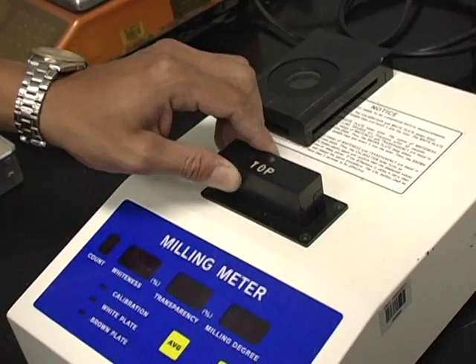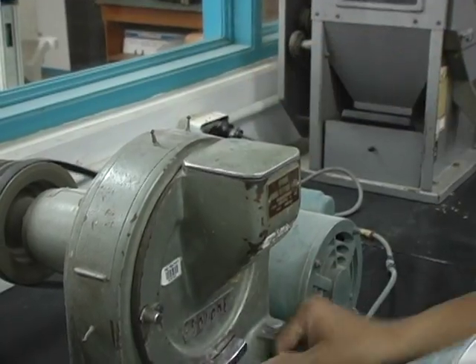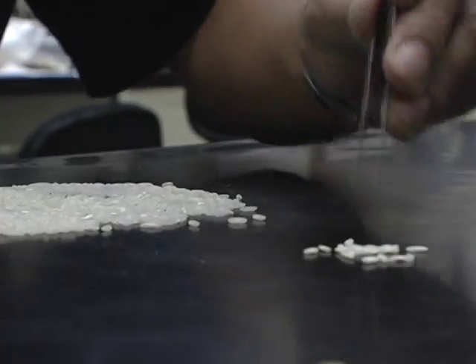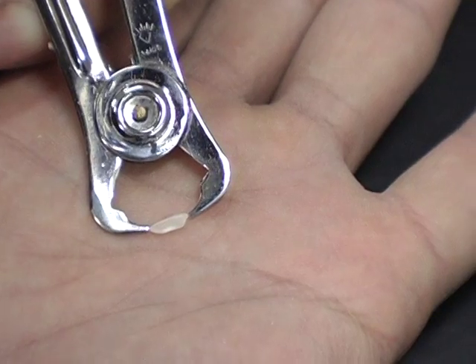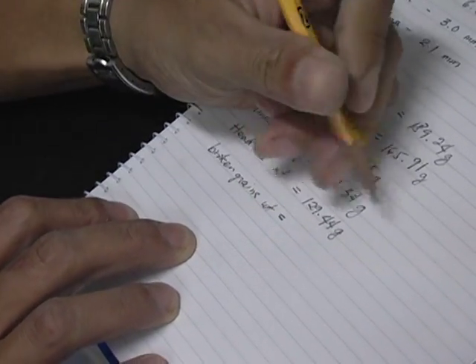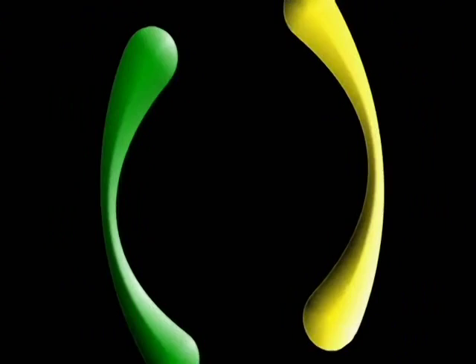By understanding the different quality traits of rice and how they are affected, you can prevent losses from occurring or continuing. White rice and milled rice have a set of distinguishing traits that can be measured to help determine white rice quality. In this video, we will show you what determines white rice and milled rice quality and teach you how to measure their physical quality traits.